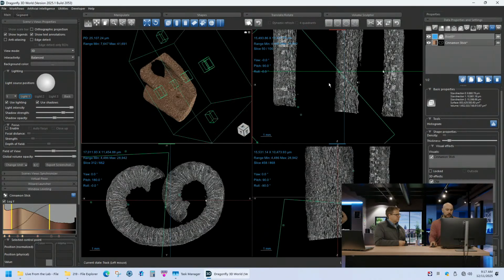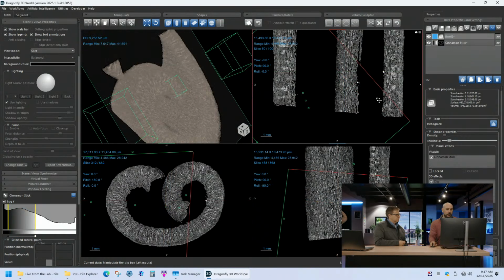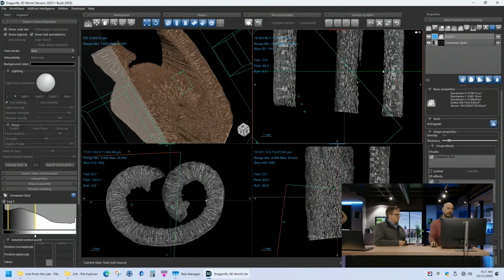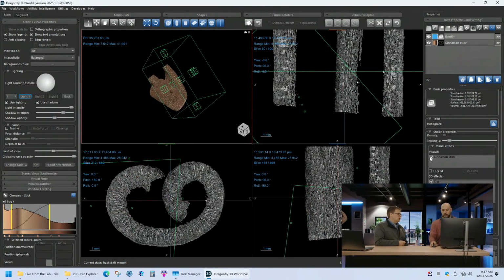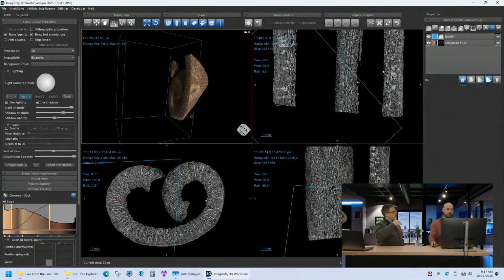And if you want, you can leave the box open. Here, let's zoom in a little bit, and now we can slice through. Again, like I was saying, you can also do this in 3D as well. Okay, what I'm seeing too, in the upper right where the volume is shown, or this display up here, is that now there's this extra entity that you added, the box.